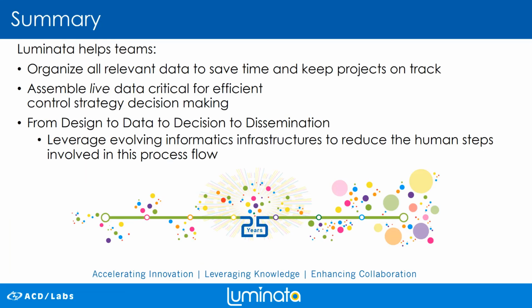By using the Luminata web portal, the chemist is able to view the family tree of a project and dynamically visualize the corresponding analytical and batch data. This is a decision support tool for any type of assessment, enabling you to make the right decision the first time around.